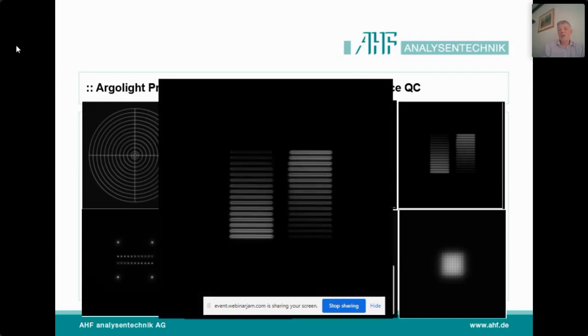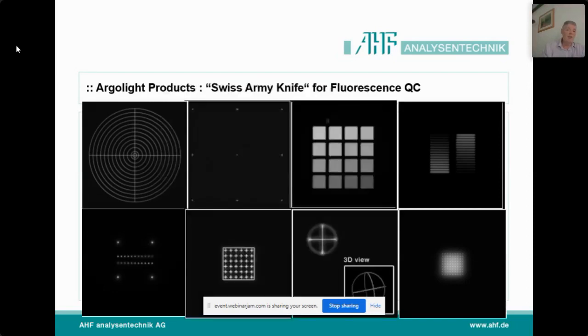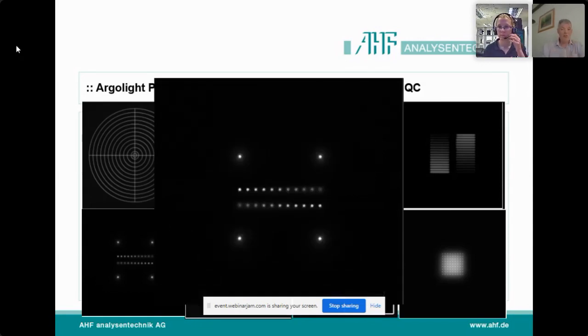You can see from here that it's going in Z, but these are also fluorescence intensity measurements where it might be more appropriate to use this as your intensity measurement rather than the other squares. So it depends on your setup. There are also different sizes. Depending on the slide, the high magnification slides and the low magnification slides might have the same pattern, but different measurements, obviously. And this is a set of stairs.